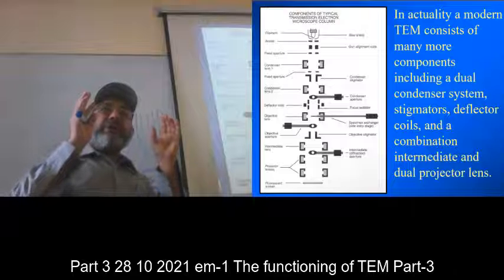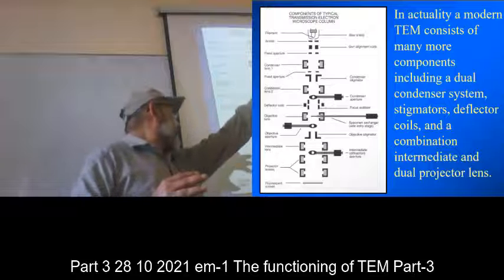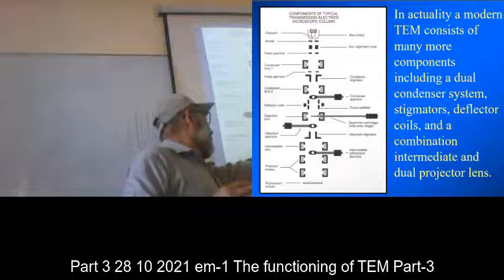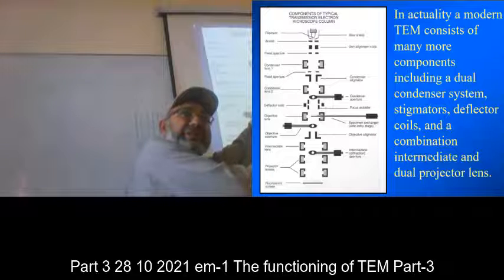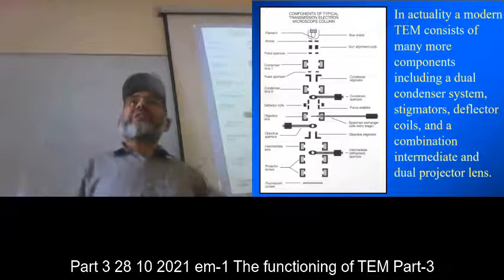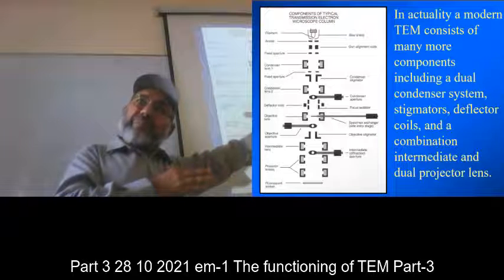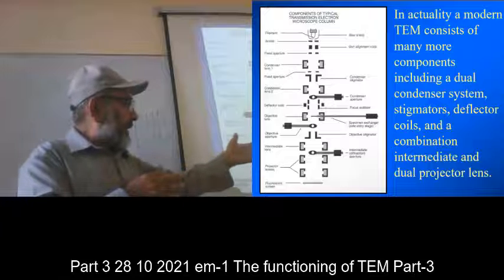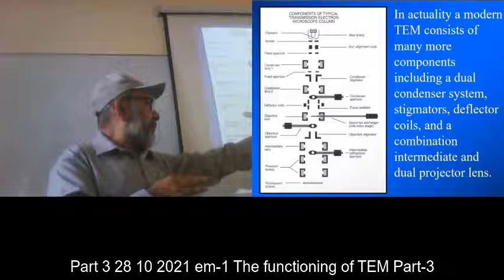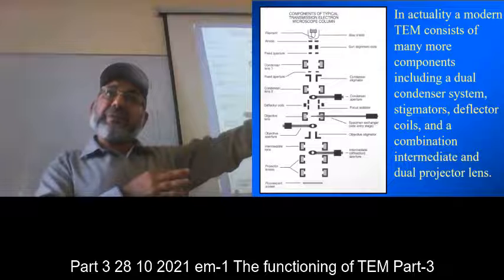Look at my hand, it looks like this, and if I decrease or increase the light, the contrast will change. And when the contrast changes, things which are invisible at high intensity beams become visible. If my hand is here in the bright area, it is no longer resolvable, but if I take you here, then some features appear.